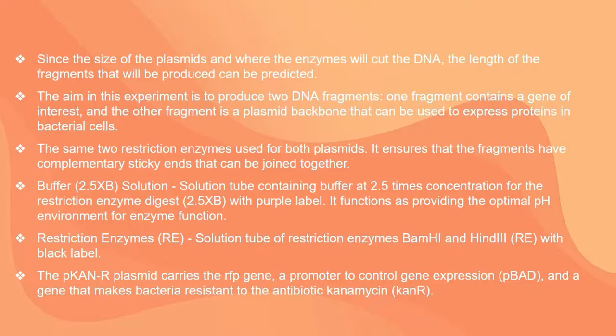The buffer solution is a tube containing buffer at 2.5 times concentration for the restriction enzyme digestion, labeled purple. It functions by providing the optimal pH environment for enzyme function. The restriction enzymes are a solution tube of restriction enzymes BamHI and HindIII with a black label.